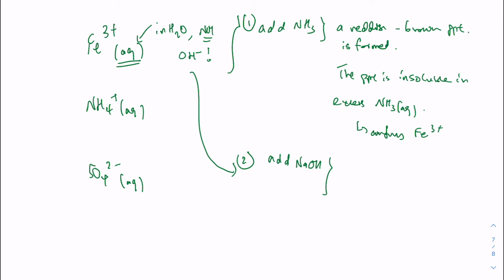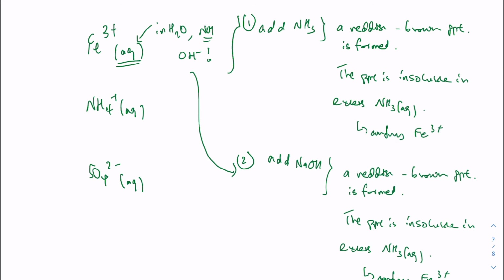Just now was iron 3 plus aqueous with no hydroxide. Now this is iron 3 hydroxide. This iron 3 hydroxide which precipitates out, right? Like the dirty green precipitate, this is a hydroxide precipitate. It looks like it is a see-through, but it is not a see-through, okay? I don't know how clear it is, but you can't see through it. If I have a word behind, can you see the word behind it? If you cannot read the word behind, that means it's not a see-through, alright? So this is an orangey, reddish brown kind of precipitate.